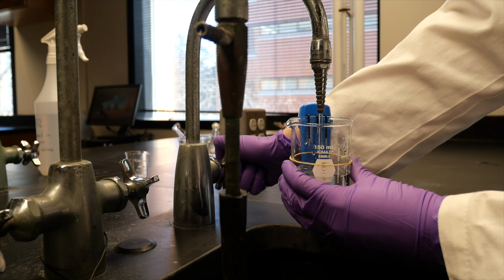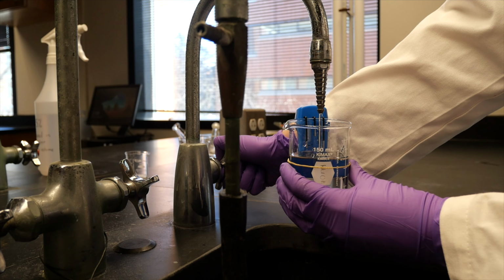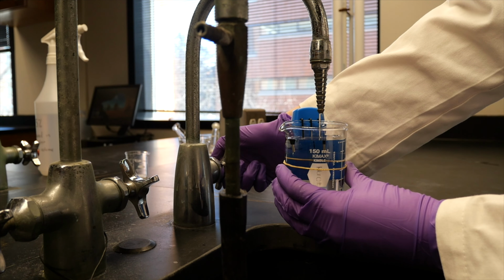Water is being put into the beaker. Hit the first level. Hit the second level.